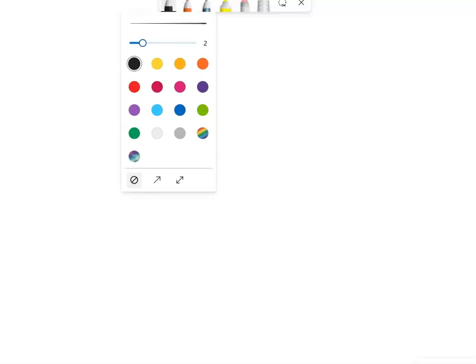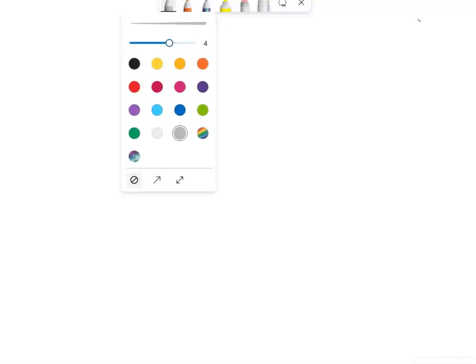If we had resolution that wasn't quite as good, what we would see instead would be kind of 2 gray blurs, and they'd be bigger and they'd be closer together. Still, we can tell that they're separate, but if we make the resolution even worse, what we would see is something like this, just a blob.